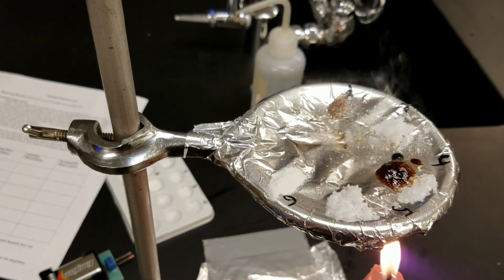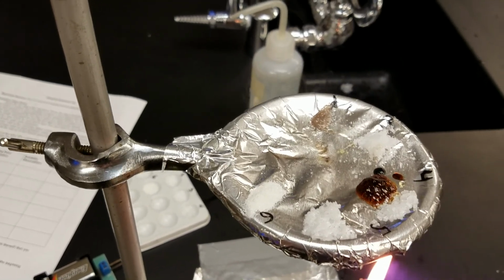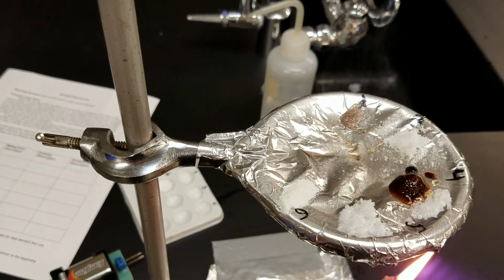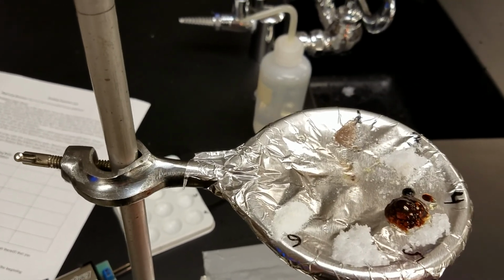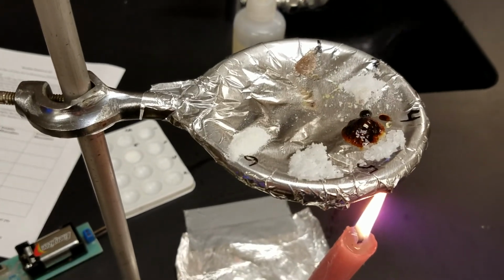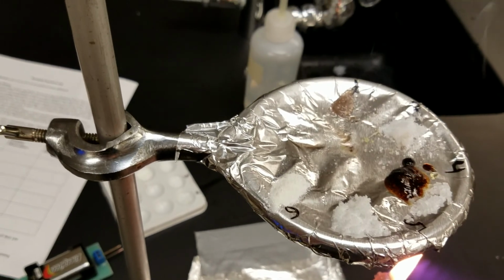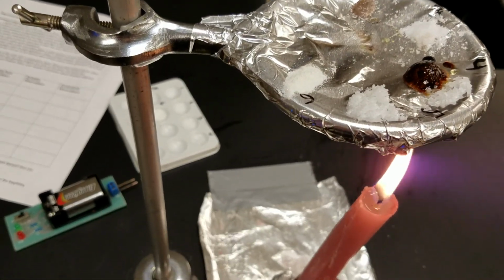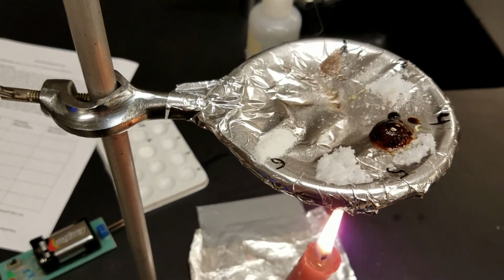Be sure to write down any observations. So we've got a pretty good idea if sucrose melts or does not and what happens. So let's go ahead and move on to the 5th one, sodium chloride, which is table salt. We'll move this right under sodium chloride.